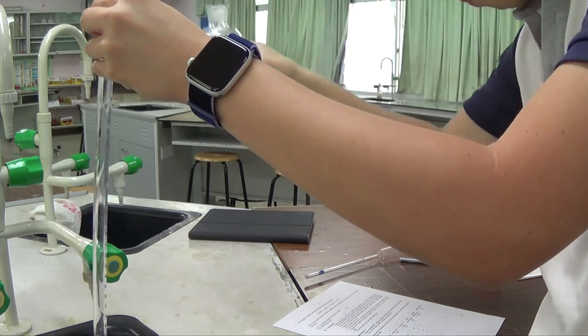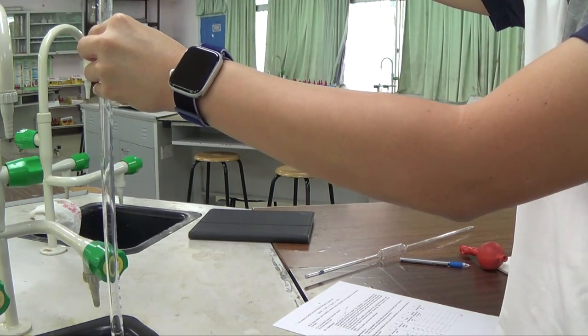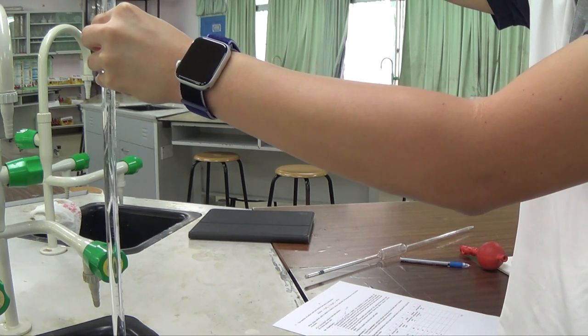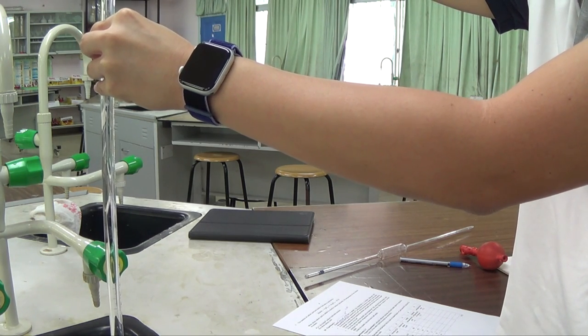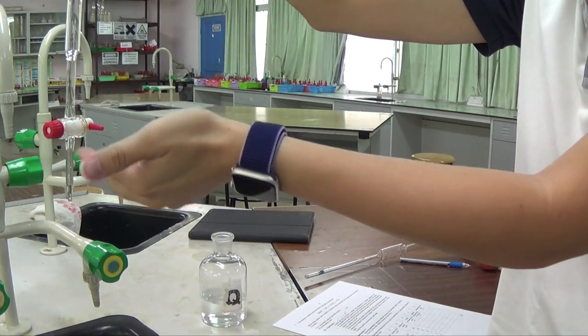How much do they say? Put Q into the burette. They don't say how much volume to use, so I am just going to fill it up. But remember, just now I closed the tap all the way.